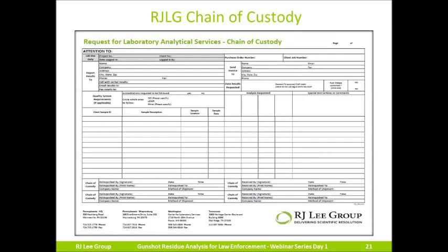This is what the General COC from our website looks like. This form is self-explanatory. The fields that you want to pay close attention to are the report results to, the send invoice to, and the client sample ID. Please list the items that you're submitting so that we can verify what you sent is what we received.